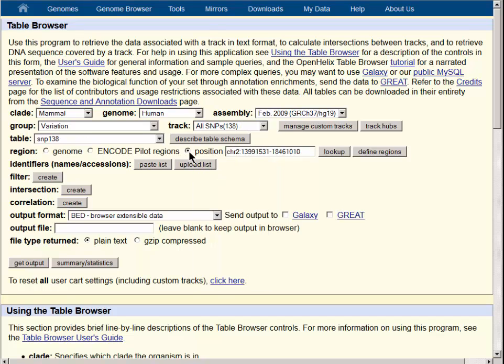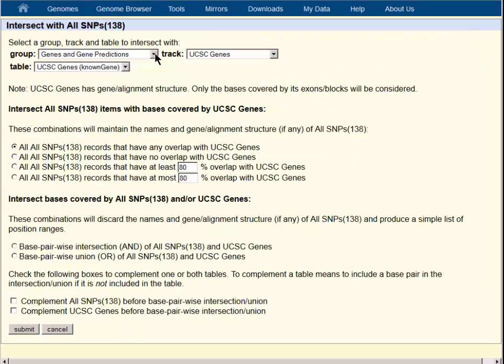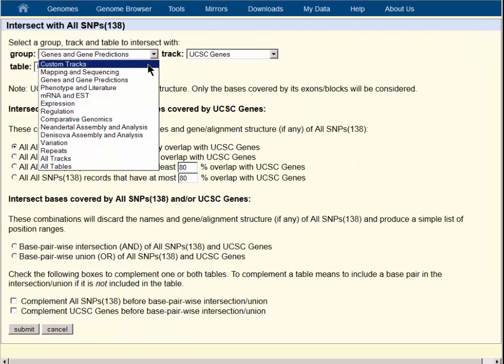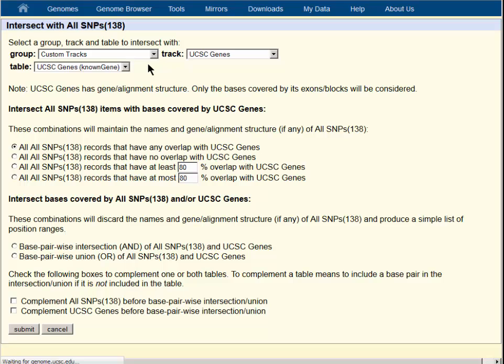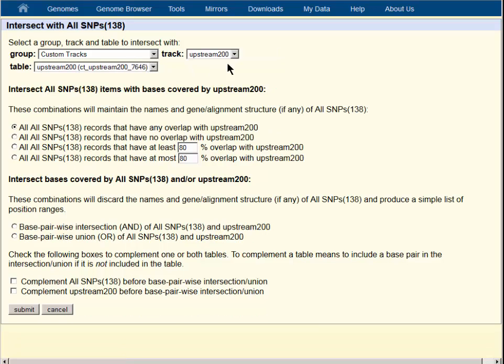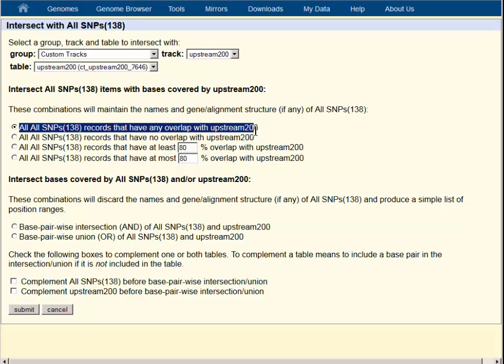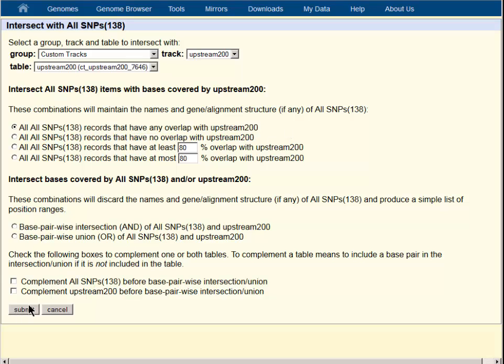Once again, we will be sure we have the position button clicked and we will create an intersection using the create intersection button. We want to go back to the custom track we created and use it as the secondary track. We have only one track in our custom track list. We choose all SNP records that have any overlap with upstream 200 and that's the choice we will accept. Using the submit button, we will go back to the table browser.